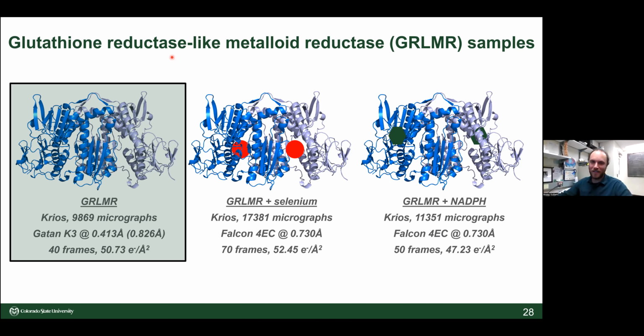Okay. So depending on where I cut off, I applied for Krios access at NCCAT. I ended up having 3 separate data collection sessions. The screening of these latter 2 samples was pretty similar to the first one here. I had a starting point considering the protein sample is the same.